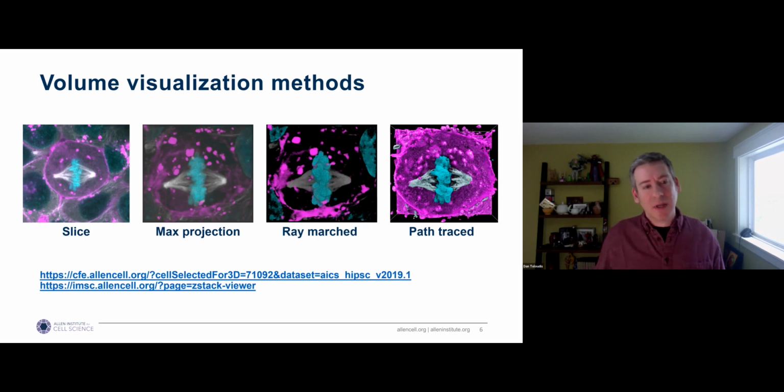So we often have to remap these intensities into ranges that make sense to be visualized, to be displayed on a computer screen, and that will make sense to our eye. And that includes doing things like changing contrast and removing noise. There's basically always some type of intensity adjustment that has to occur for display. And that particular adjustment may be different for each of these viewing modes.